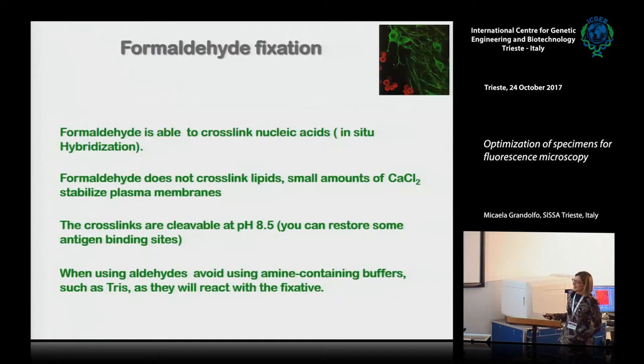And this is another one. Okay, it is funny, but sometimes it happens. So I would like to give you this advice. Avoid dissolving aldehyde in amine-containing buffers such as Tris, for example, because in this case the aldehydes will react with the amines present in the solution and not with your tissue.